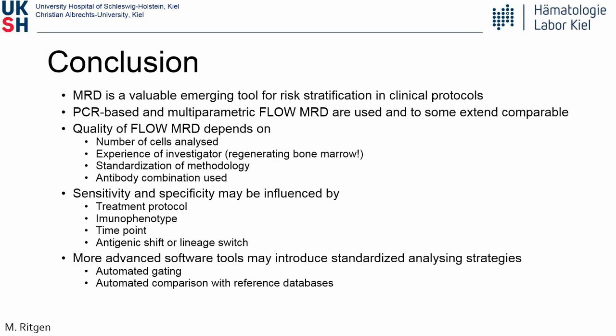Okay, thank you for clarifying this. So also back to the markers. We've also been asked, can CD38 discriminate between the leukemic cells, hematogones and plasma cells? And someone's commenting and saying, well, it might depend on the brightness of the expression. What's your view on this?